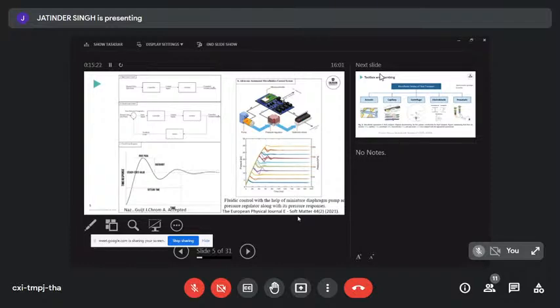If we look at the response time that's coming out with our flow, we have a couple of different parameters that are important to think about if they are important for the assay you're developing. So if you switch on the pump, you want to go to a certain steady state value, let's say 5 microliters a minute.